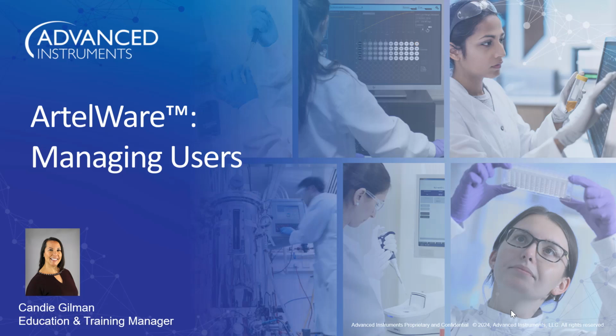Thank you for joining me for this tutorial focused on managing users in the ArtelWare application. I have a lot of great information to share with you, so let's go ahead and get started.